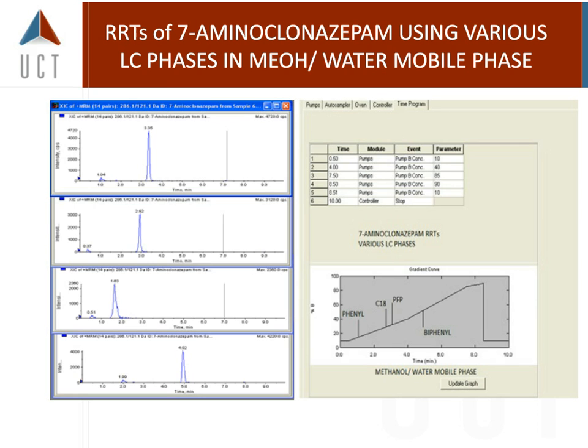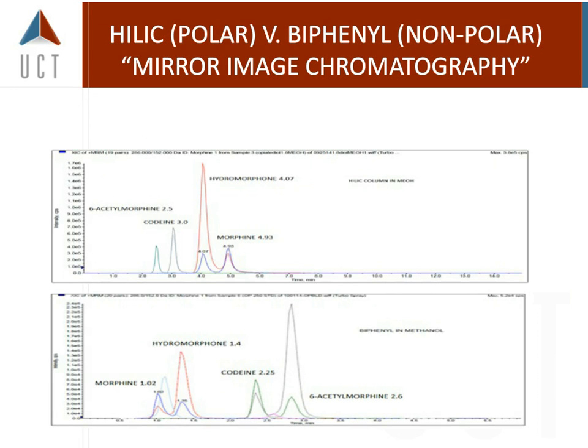And here again is the same gradient, and you're looking where your phenyl group is the least retentive, and as you move down, you see the exact same gradient procedure, which is outlined above, is that just by changing that phase, that particular compound reacts differently. So essentially, using the pictures that I could generate from my LC chromatograms will give me some indication as to the efficiency of all of the compounds in my solid phase extraction procedure.